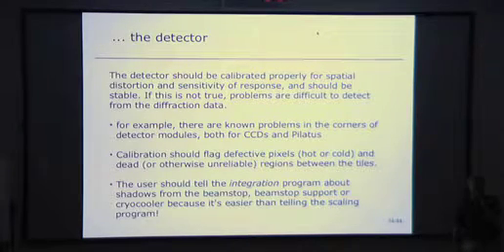Okay, and then the detector. Now, you say the detector should be calibrated properly. This is done pretty effectively by the manufacturers, so it's not something that we really need to worry about at our stage. If we notice problems at our stage of using the detectors, then it's something we should tell the manufacturers about, I think.